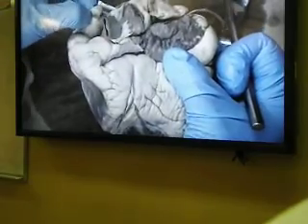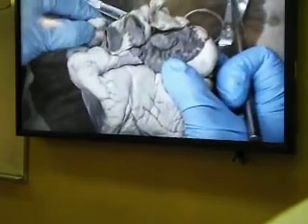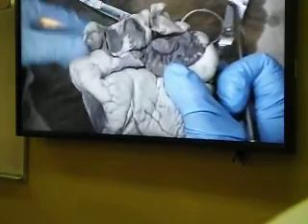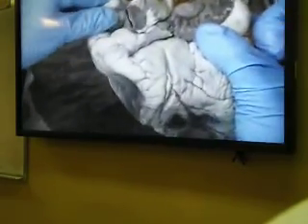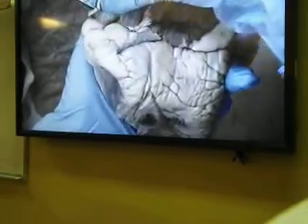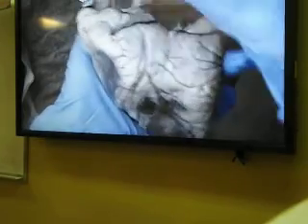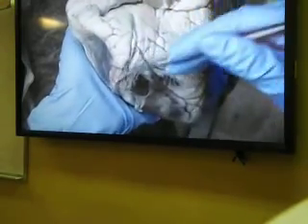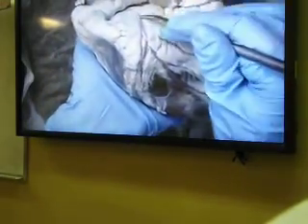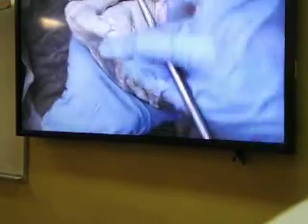It's the right atrium. Remember, the right atrium doesn't have to do too much work, and most of the space of the right atrium is actually given by the right auricle. So the right atrium is the chamber, just this tiny chamber. Then the rest of it, this is the lower chamber, and this is underneath the right atrium and on the side of the anterior interventricular sulcus. So this has to be the right ventricle.